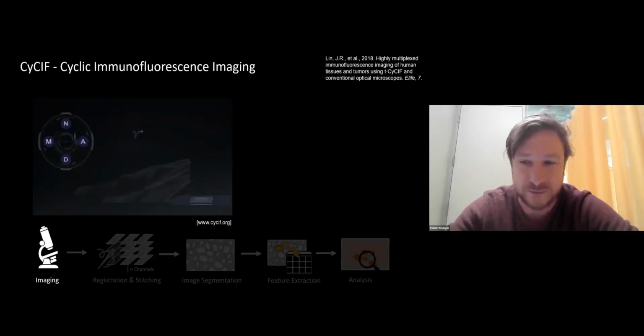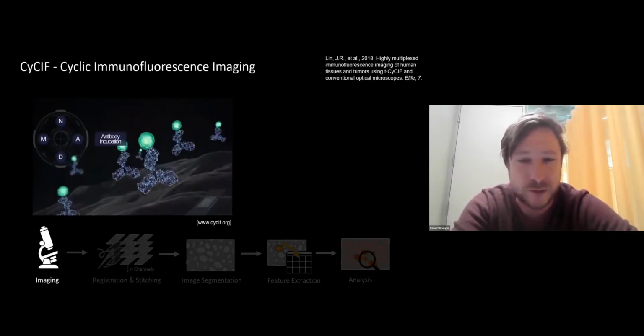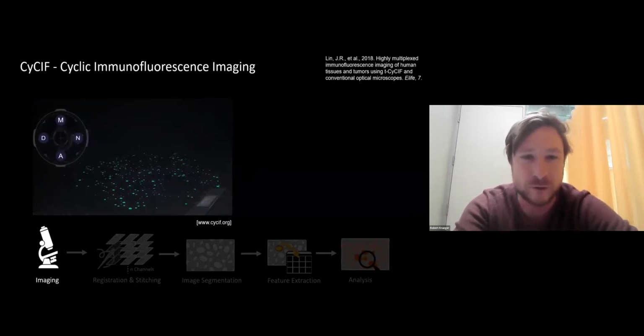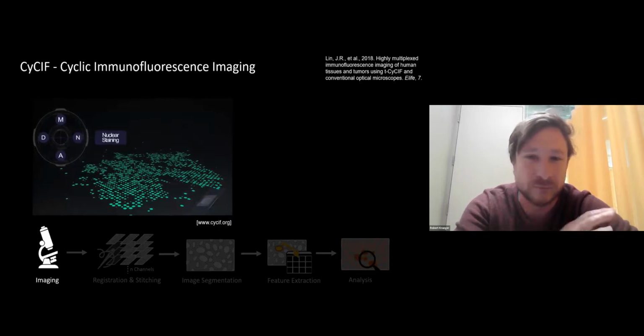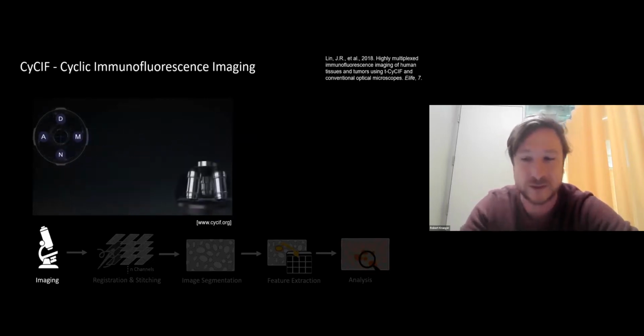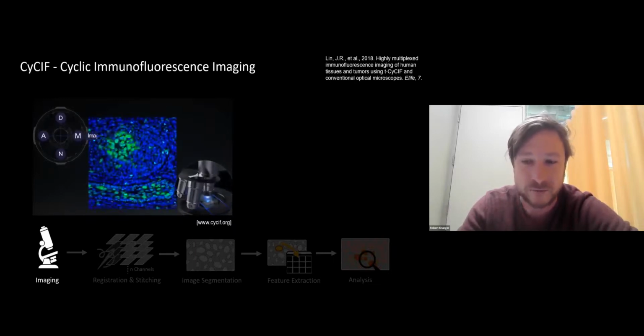So as a first step, antibodies are put on a tissue, currently limited to 4 antibodies at a time, but there are newer microscopes that we already experienced that can do 20 to 30 in one shot. These antibodies are conjugated with different fluorescence dyes, making the molecular state of each cell visible.